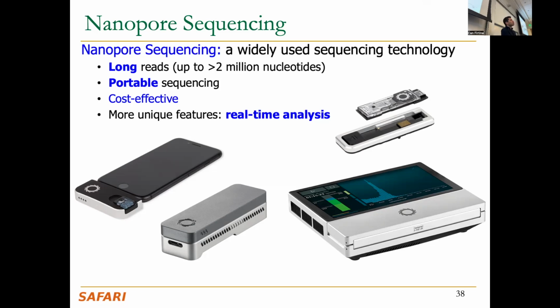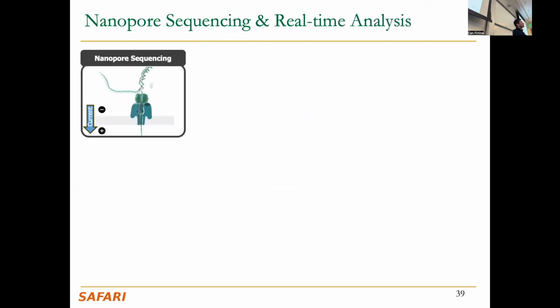It provides opportunities for portable sequencing because there are these devices that can literally fit in your palm, so you can carry it with you and then do your portable analysis. It is relatively cost effective. And there are also some more unique features, such as real-time analysis, that I'm going to be covering now.